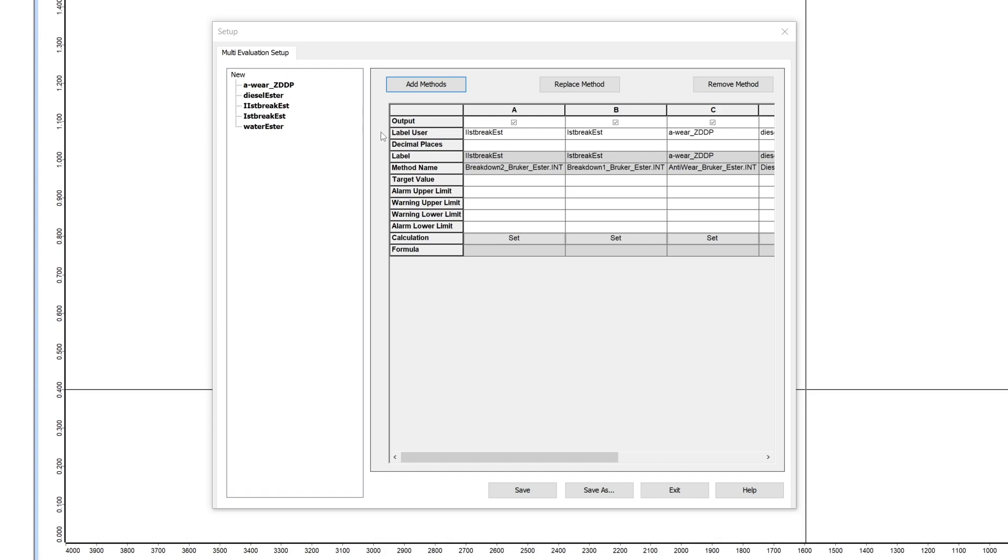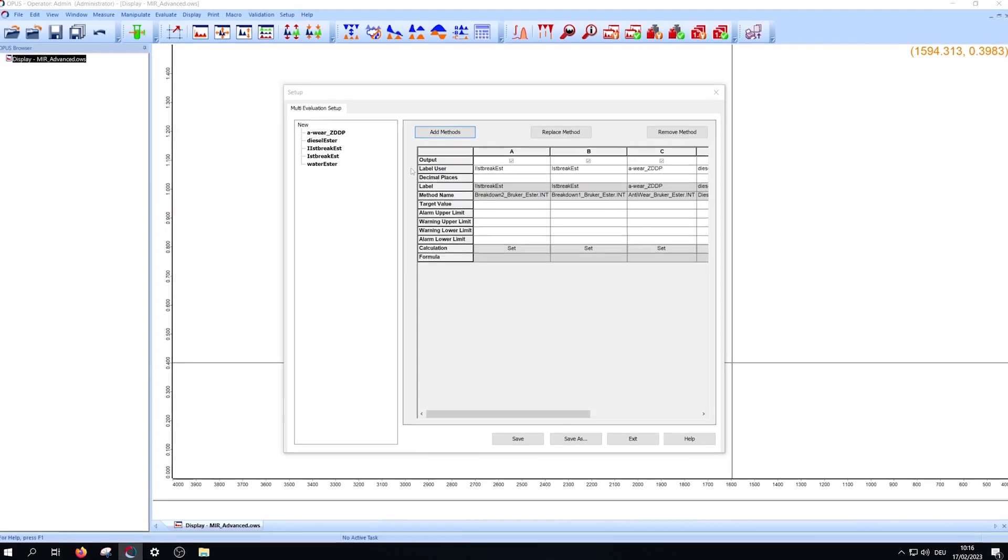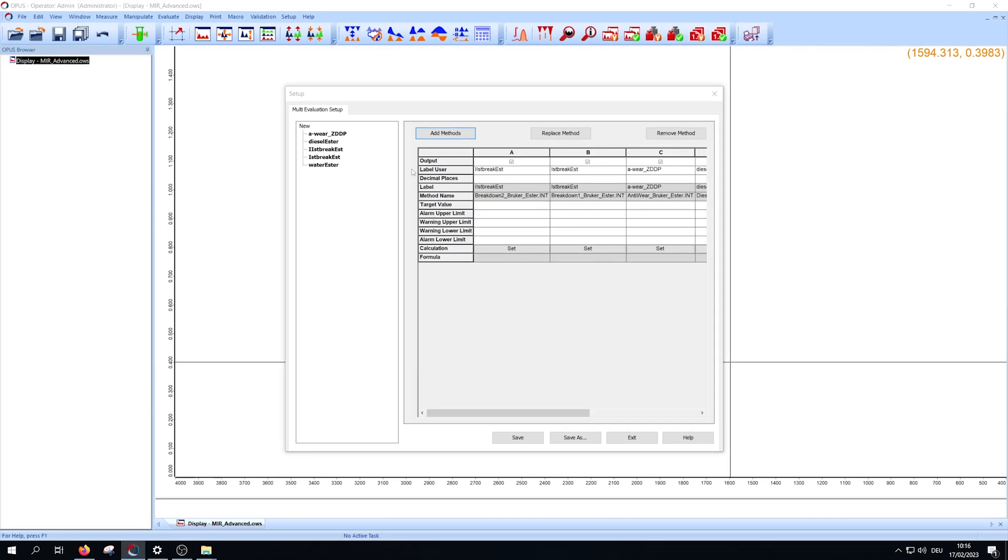Per default they have the same entry like the label, but you can change them. This is a name which will be written in your report. You can also change the number of decimal places your values will have in the report.